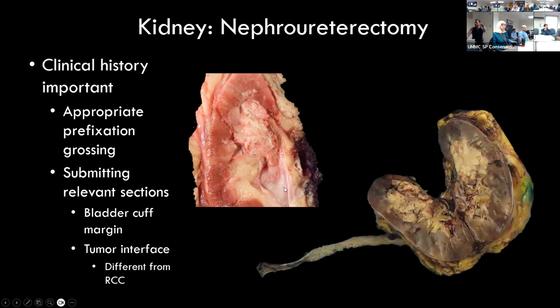You're looking to see if the cancer that's present inside the pelvicalyceal structure is extending into the renal parenchyma or the peripelvic fat, either over here in the hilum or on the other side in the perinephric area. So the interface and the relationship that you're looking for is different. So your samples have to appropriately represent those, okay?